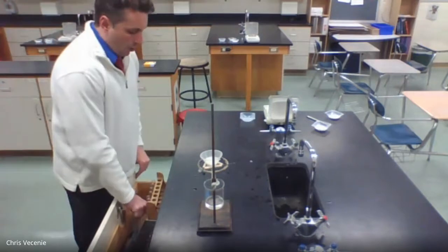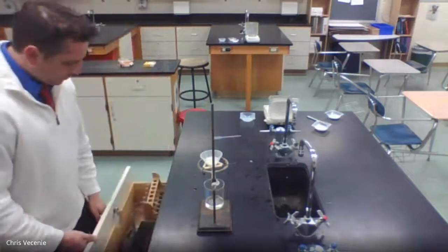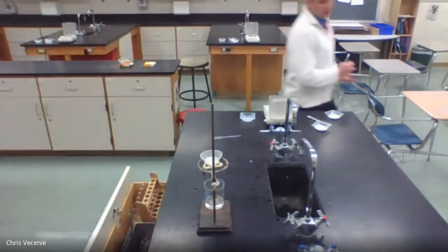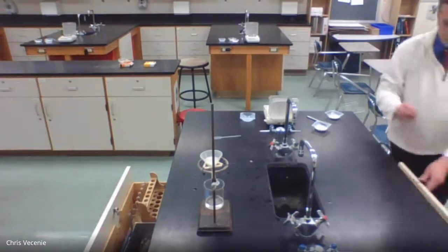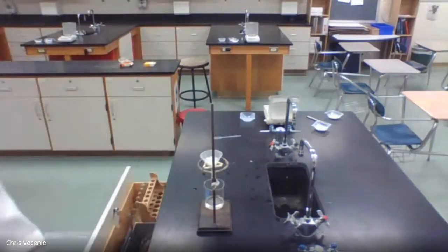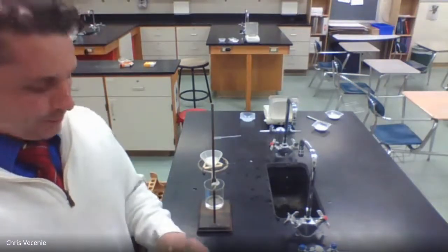All right, now, one last little time where we have to wait. Once this filter's off, what I'm going to do is go into my drawer and get one of those circular watch glasses out. Right in every drawer has them. It looks like this. All right. And I'll just give it a quick wipe off just so that nothing on the watch glass gets stuck to our filter paper.